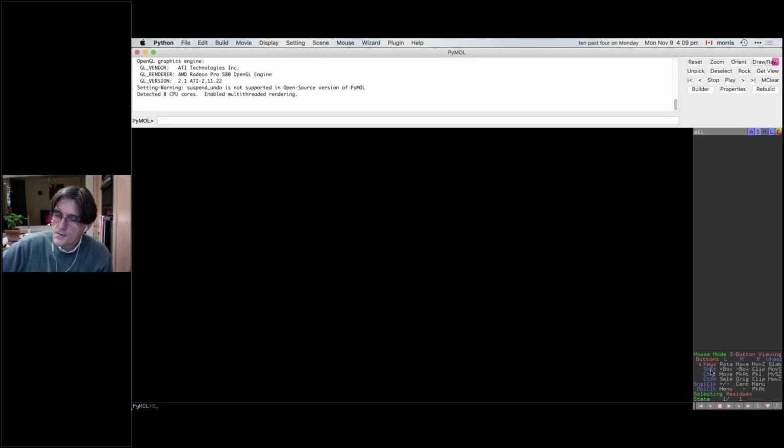And then we can see how the modifier keys on the keyboard, so Shift, Control, Control-Shift, etc., single click, double click, affect various things. Then we've got selecting, and if I click here, that changes the level at which we select things. So I can change through to chains, segments, objects, molecules, C alphas, and atoms, and then it goes back to residues.